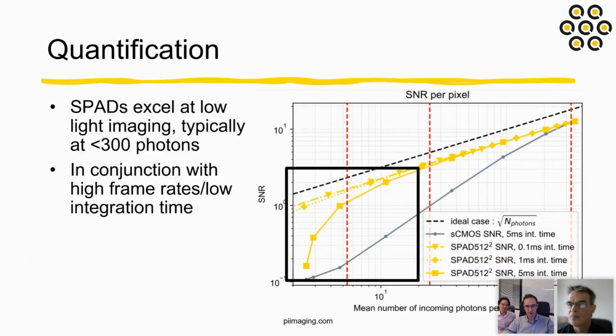Okay. And can you give the fill factor as a percentage of microlens versus non-microlensed? I do not know the percentage, but as mentioned, you can consider that the size of the microlens detector is 16 and the non-microlens is 6.5. Okay, thank you. What is the practical dead time of a SPAD pixel? This is in the range between 10 and 50 nanoseconds.